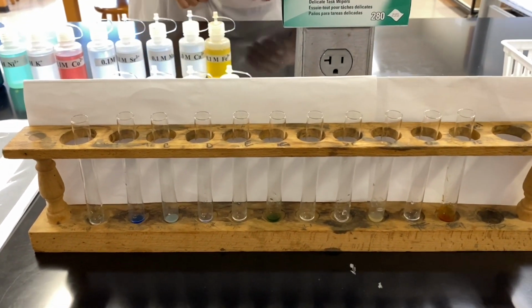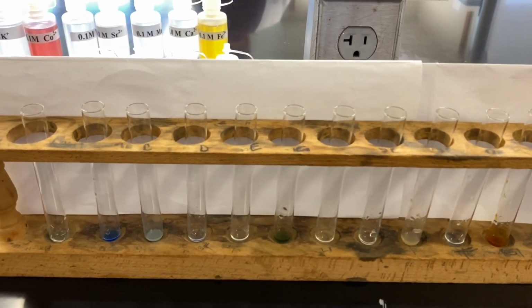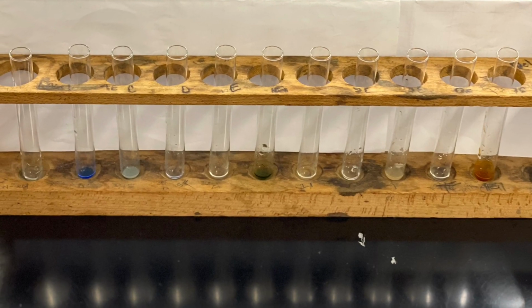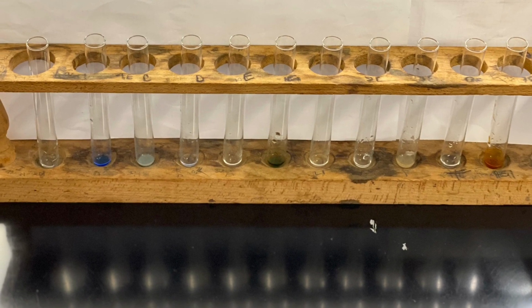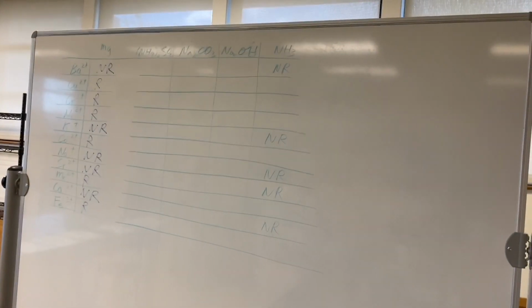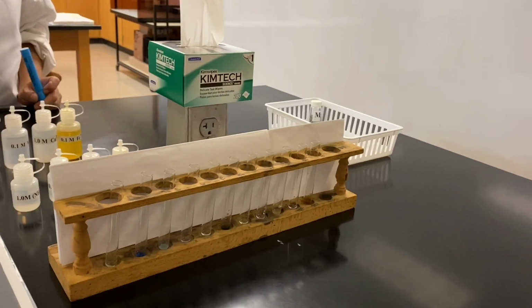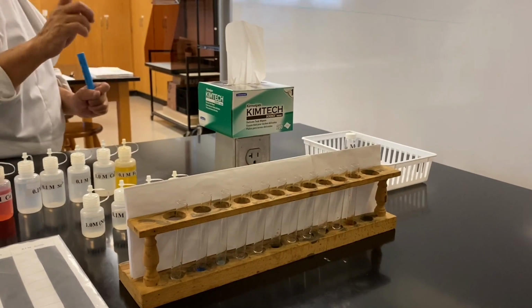For reactions with ammonia, record on page 49 if there was a reaction or no reaction. But unlike with magnesium, you have to be specific if during the reaction there was just a color change or a color change along with precipitate formation.